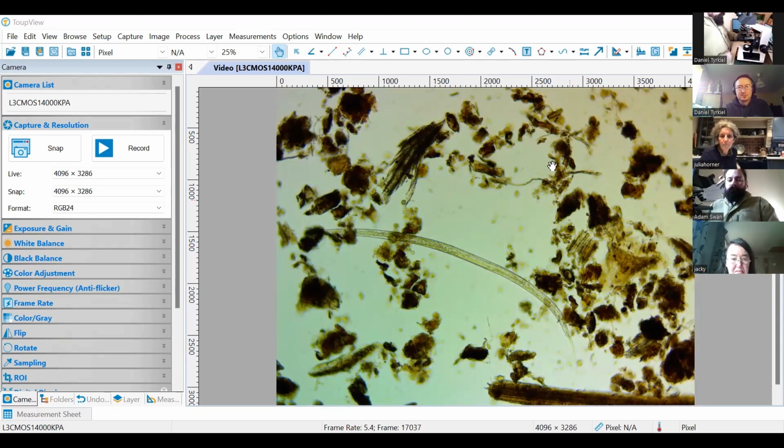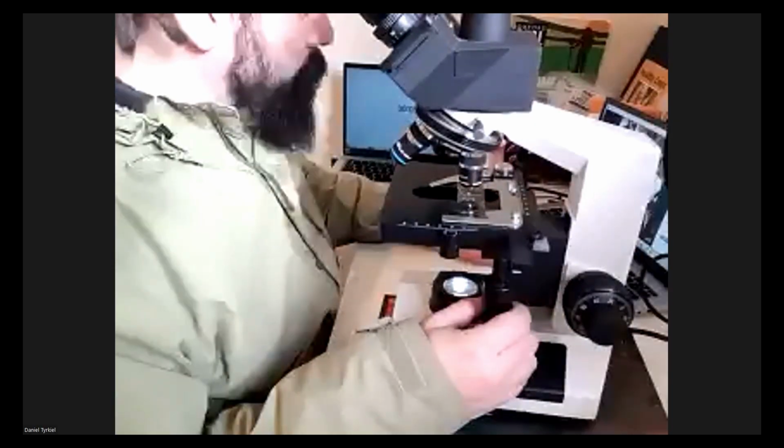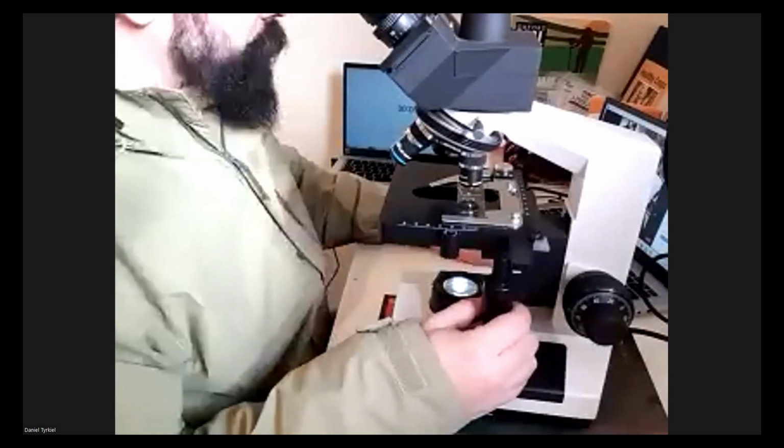Cool. So now after the nematode count, we'll go on to the main count, which includes fungi, actinobacteria, flagellates, ciliates, and amoeba. So if you stop sharing for a second, I'll show the spreadsheet, and everybody will see exactly what we're counting and how we're counting that. So I'll share my screen again.